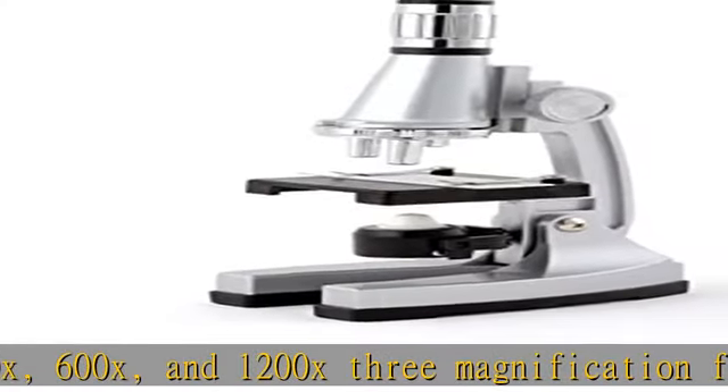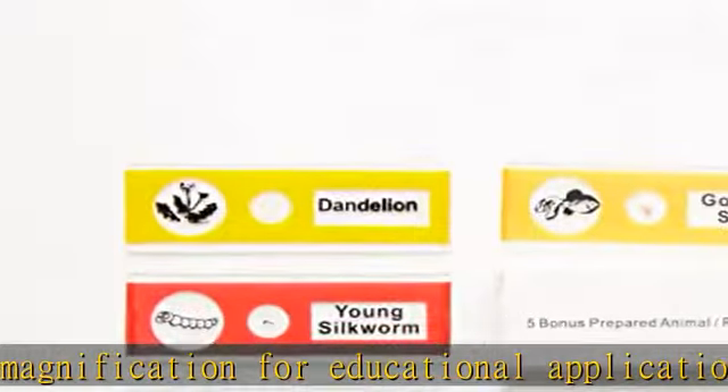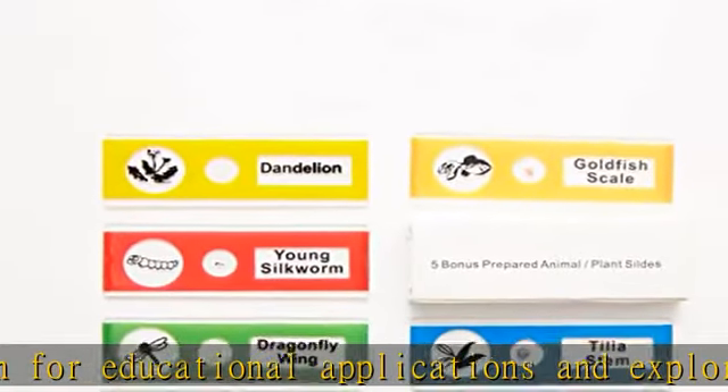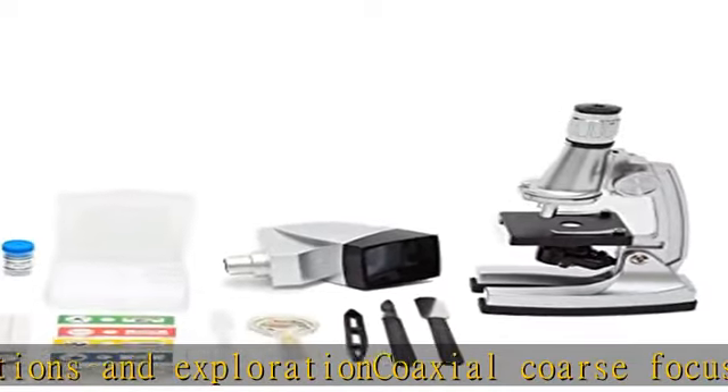Includes microscope tools, microscope slides, pipette, scalpel, tweezers, samples, and so on. Comes with 5 bonus prepared animal/plant slides. See the description to get this product today at the best price.